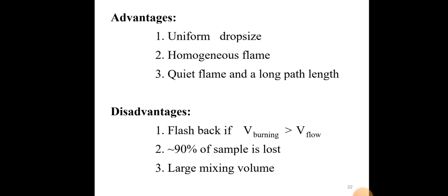I mean, if the gas flow is not enough, then the flame can flash back into the mixing chamber, and we may have an explosion. So it is more dangerous. One of the disadvantages of this burner is that it is more dangerous than the total consumption burner.